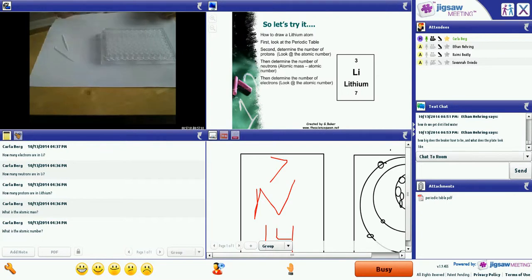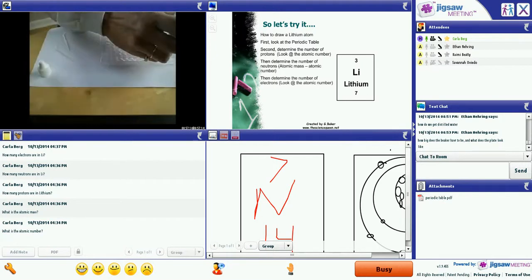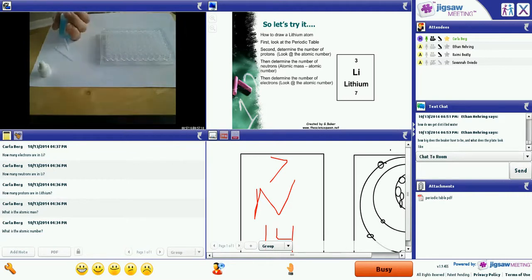Okay, the copper nitrate has a nice blue tint to it. So add 1 drop of copper nitrate to well A1. So that is our first one here. When I add my drops, I go straight up and down, and I have 1 drop.